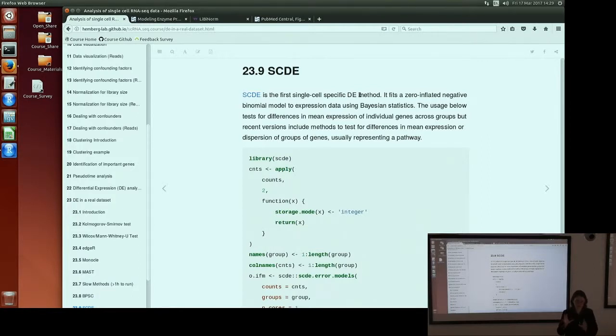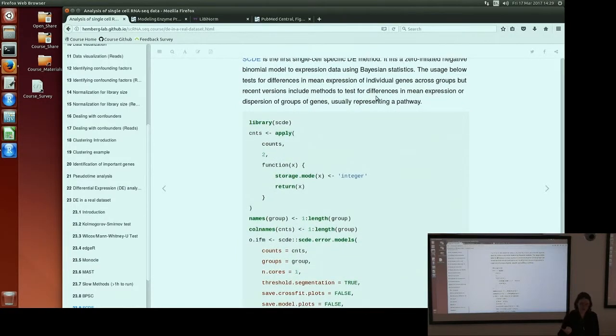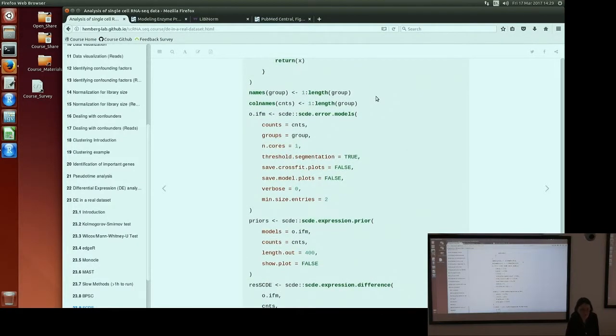So it's a very complete model, but it takes a long time to fit it and run the test. But it does, in our experience, at least for full transcript data, give slightly better results. Yes, it can be parallelized.